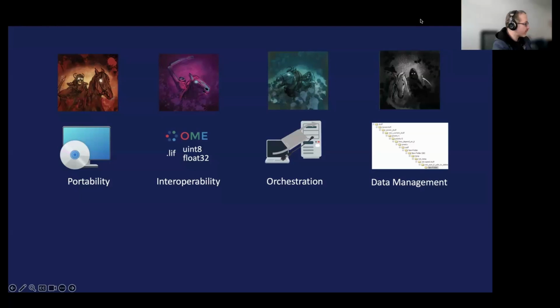But ICY is a great tool. It has ways of sharing workflows, and I adopted a lot of their ideas into Arkitekt. And I think for now, it's the better solution if you want to run things locally. I'm hoping that Arkitekt will get to the point where ICY is. Let's put it this way.